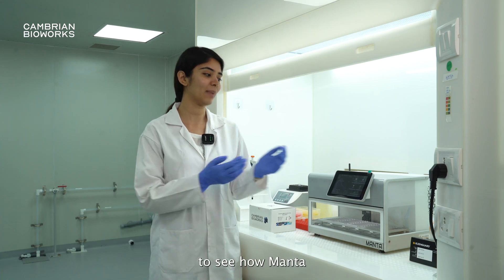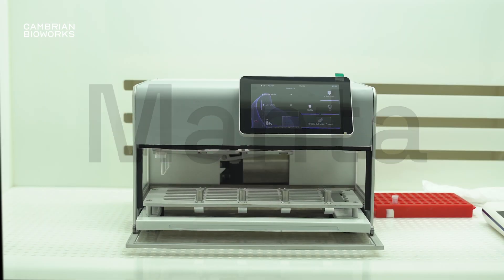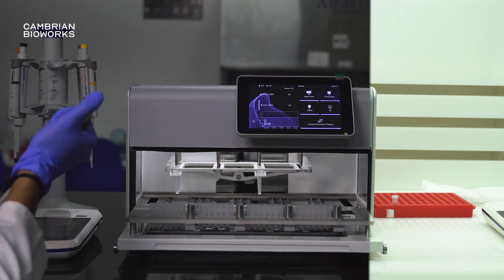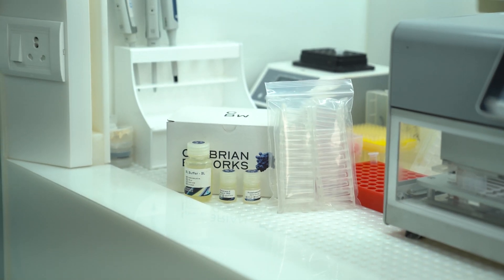Hi everyone! Today we are here to see how Manta can simplify your lab work. To begin with, let's unbox the Blood DNA Isolation Kit.